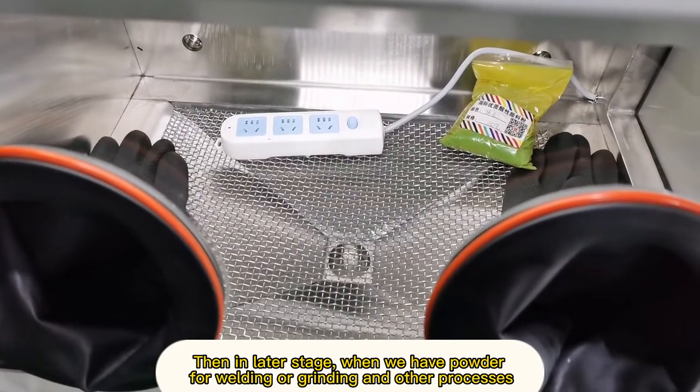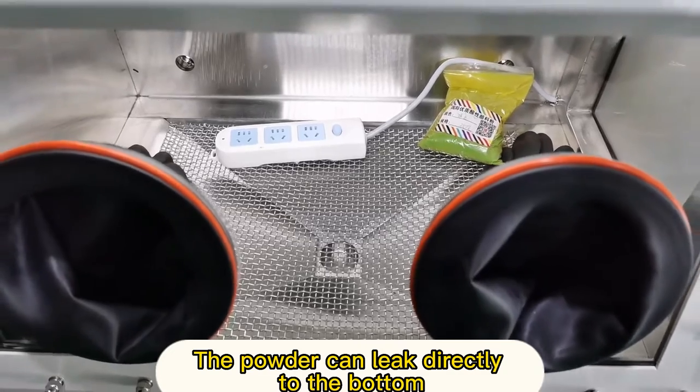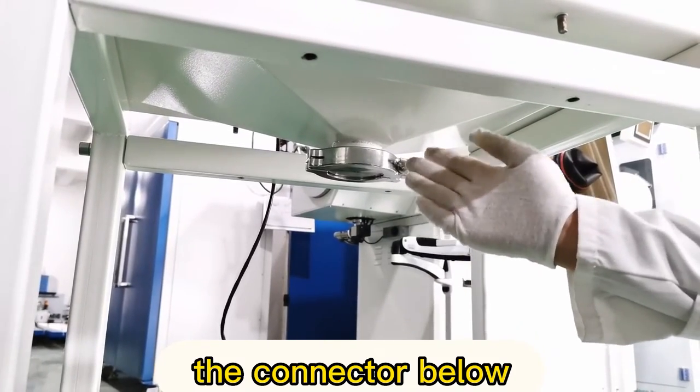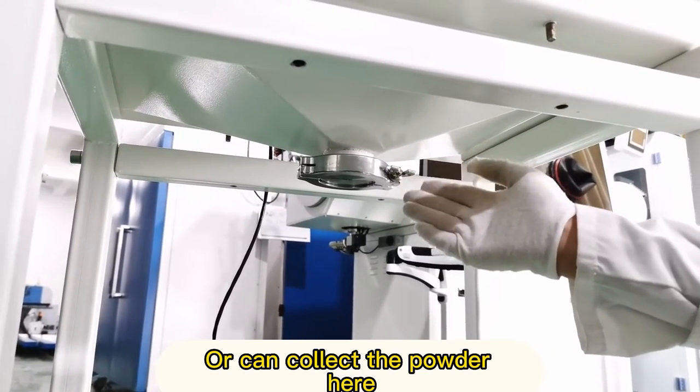Then in a later stage, when we have powder for welding or grinding and other processes, the powder can leak directly to the bottom — the connector below. We can connect to the ventilation duct, or can collect the powder here.